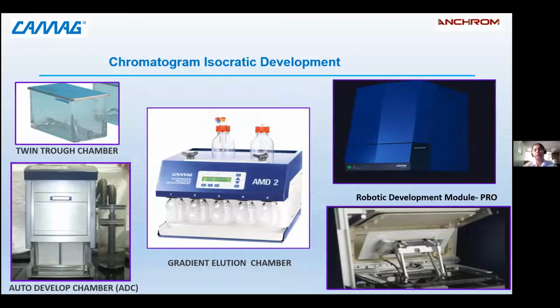So for controlling the humidity, we have ADC2, that is automatic development chamber, where you develop your plate automatically. The sensor senses how much it is developed. Once it is developed, it will automatically take your plate up. It will dry your plate automatically.